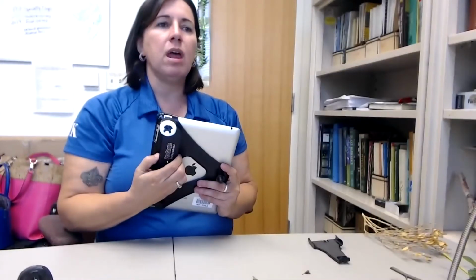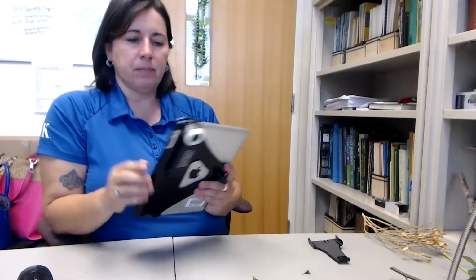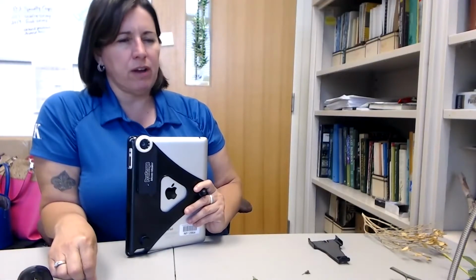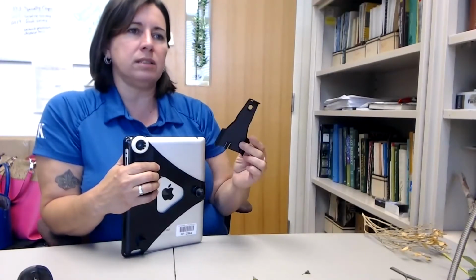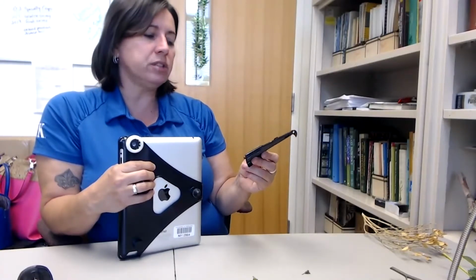So it just kind of depends. They're a little bit slow. Now, if you want both, when you buy the Pro Scope, you get one clip. So I bought mine with the iPad clip, but I bought the phone clip separate and alone for like $30 or $35. So you're looking at $150 for the Pro Scope plus one clip, and then the additional clip was I think $35.